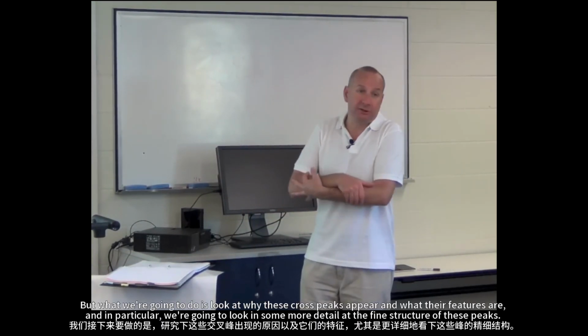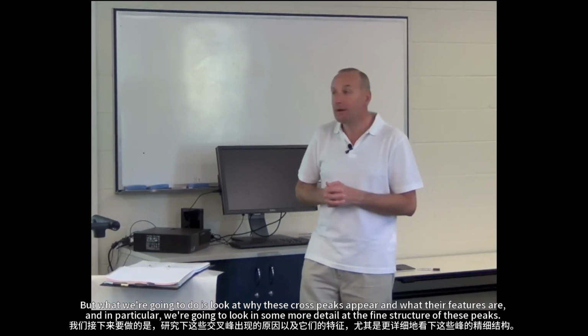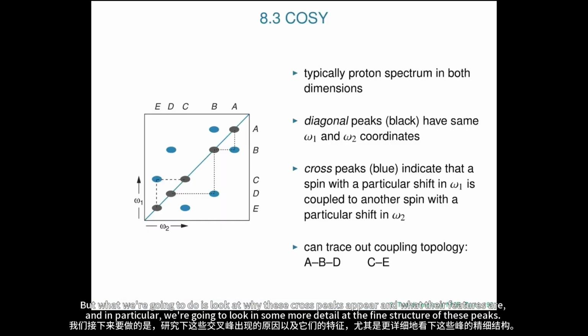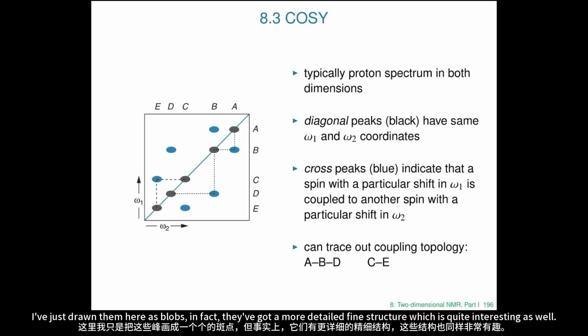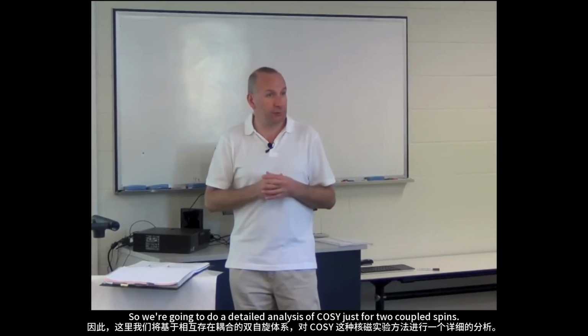But what we're going to do is look at why these cross peaks appear and what their features are. And in particular, we're going to look in some more detail at the fine structure of these peaks. I've just drawn them here as blobs. In fact, they've got a more detailed fine structure, which is quite interesting as well. So we're going to do a detailed analysis of COSY just for two coupled spins.